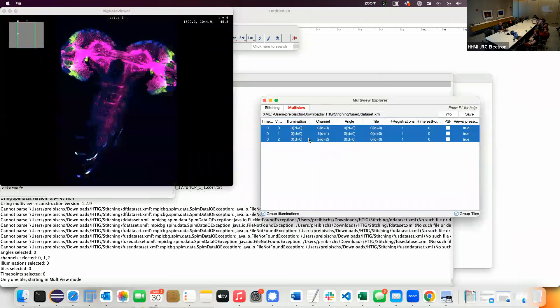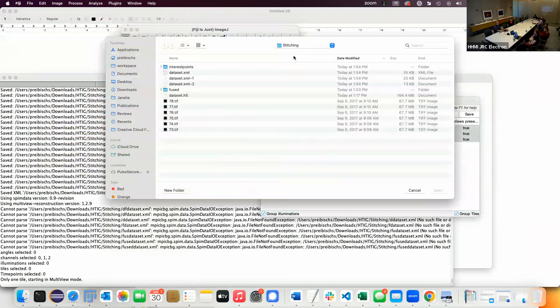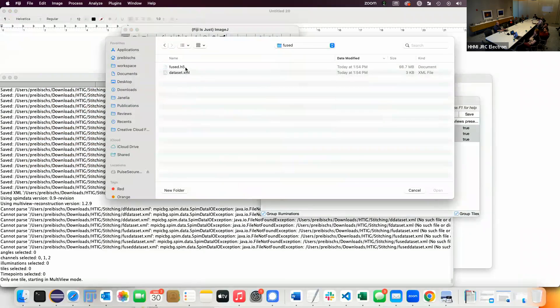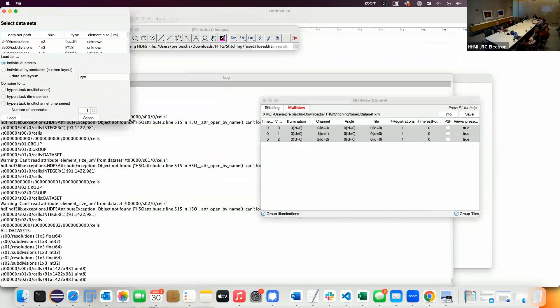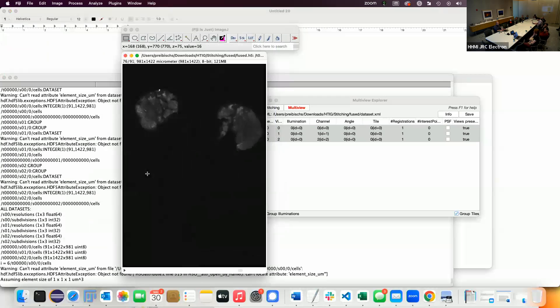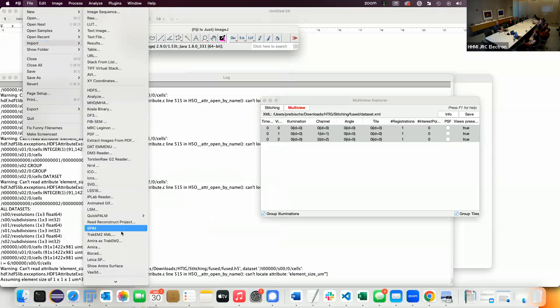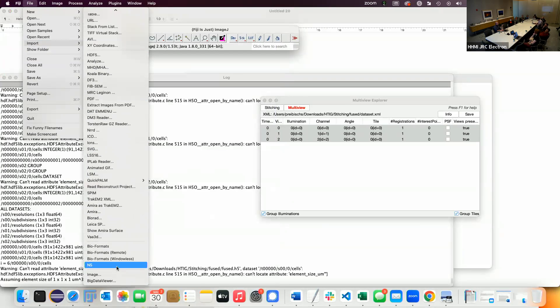Now we have the dataset. You can just as well open it here with the HDF5 loader — specify the HDF5 file and it will open it. You can see what it created — it didn't create a multi-resolution pyramid, only the full resolution version. In the future we want to support creating multi-resolution versions on export. The other way to load this is the N5 API loader — it's a bit confusingly named but supports ZAR, N5, and HDF5 to load.